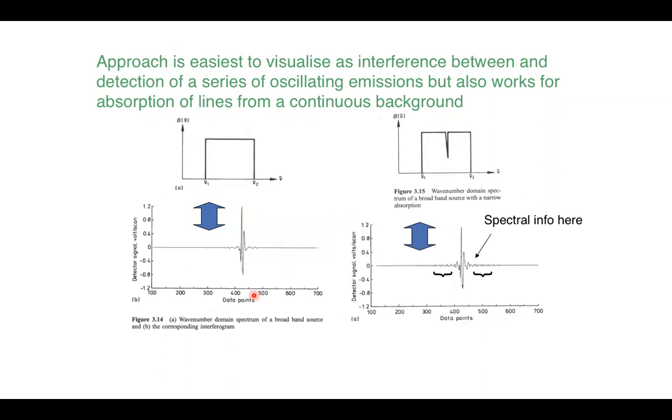Actually, you can view this in the software usually for the spectrometer. You can see this, and this is one of the ways in which you can tune your infrared spectrometer to make sure that everything is working as it is supposed to. So some of this is just the information from the light source. So you can see here, there's no absorption. So this is the start of our light source frequencies, and this is the end of our light source frequencies.